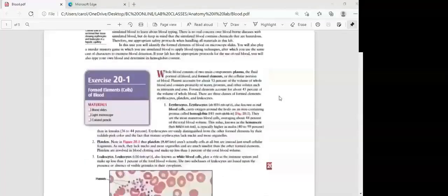We're going to start with the blood. You go to the doctor, and the doctor takes some blood from your arm, and they're going to put your blood in a little tube like that. Right, that's a test tube. And your blood is in there, and what they're going to do is put this blood in a machine called a centrifuge.